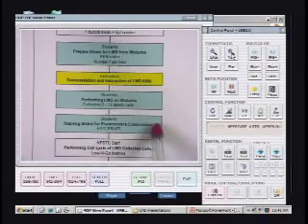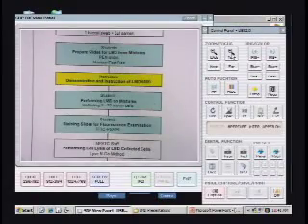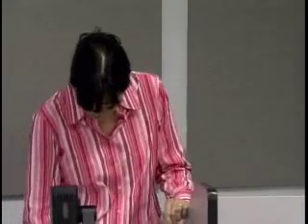And there's also fluorescent examination. This will be going on at the same time. When half of you are doing dissection, the other half will be preparing the fluorescent slides. Then you will switch off.